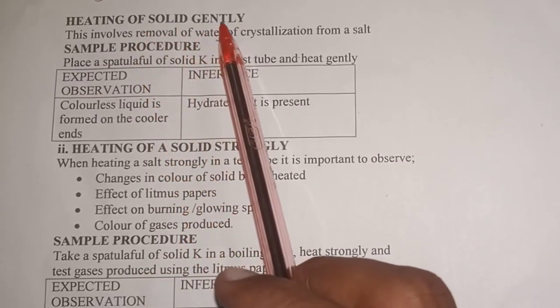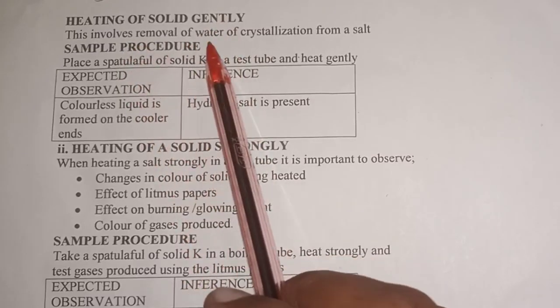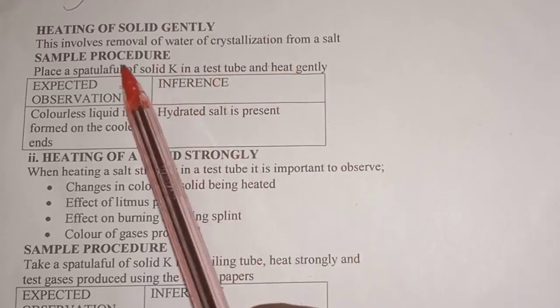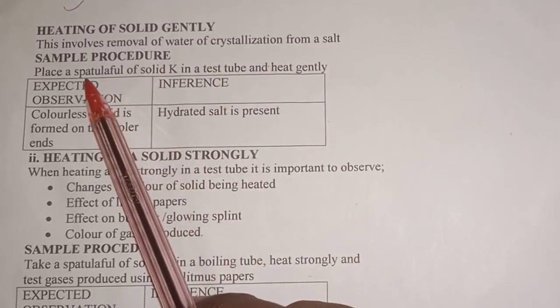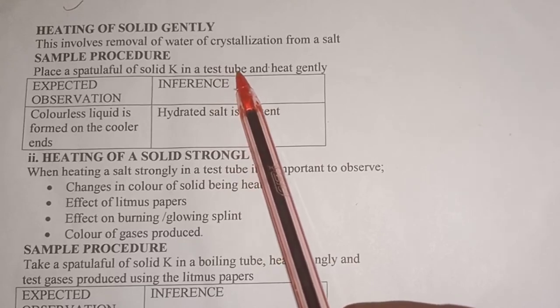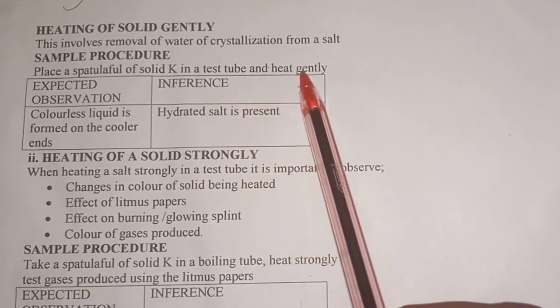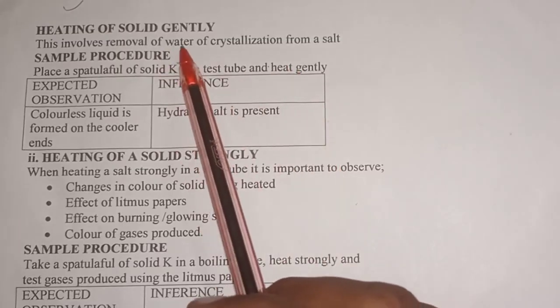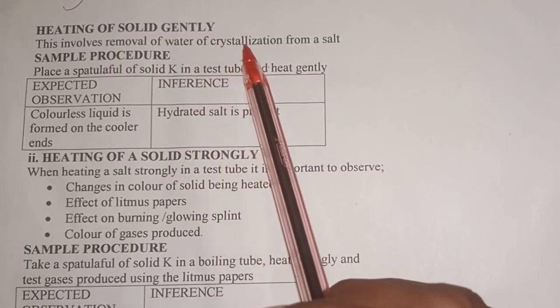Heating of the solid gently involves a removal of water of crystallization from a salt. Now, sample procedure: you place a spatula of solid K, just an example, in a test tube or a boiling tube, and then you heat it gently. So we said when you are heating a solid gently, what you are trying to remove is water of crystallization.